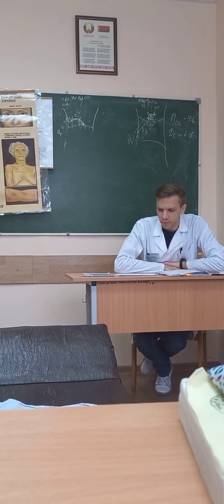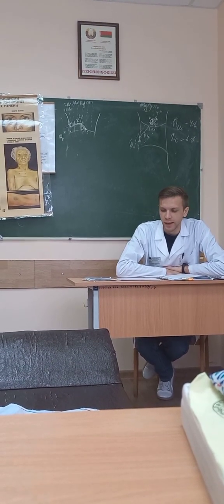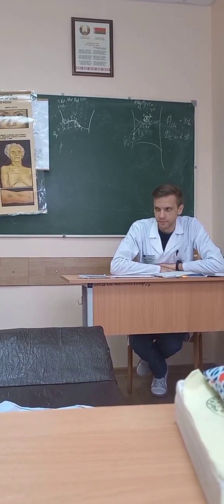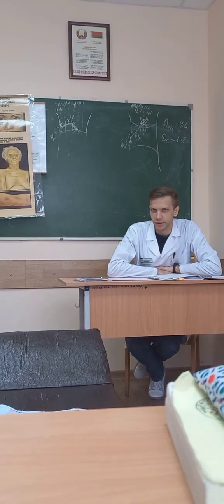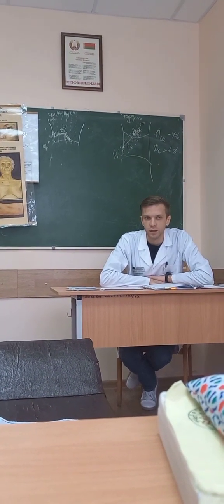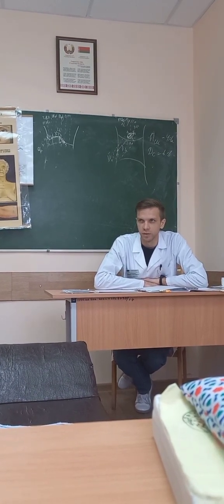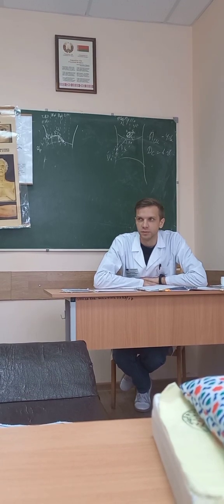So, muscular fibers. In normal situation, they have to be digested, or without striated pattern. If you will see undigested fibers or fibers with striated patterns, patient has problems with proteins digestion.